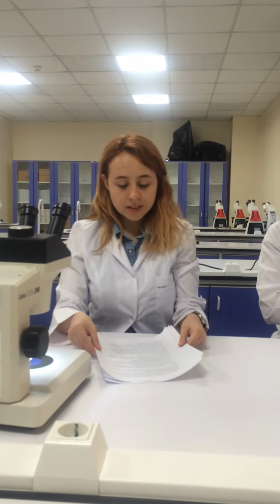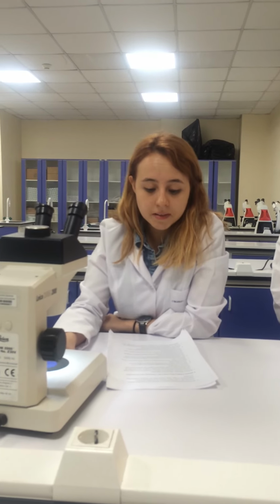The tube is returned to the 37 degree incubator. This is also day 0 of differentiation. The last step is that the chondrocyte induction medium is replaced every 3 days without removing the cells on the bottom. Mature chondrocytes will form in approximately 14 days. The chondrocytes are ready for toluidine blue staining now.